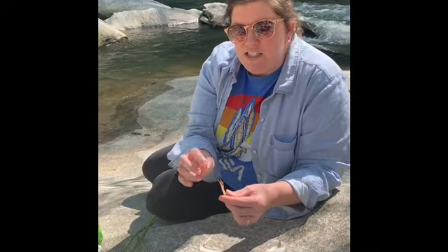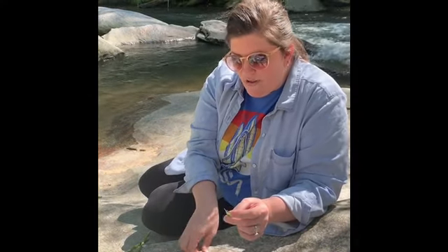Alright, and so then I have these little pieces at the top that almost look like seeds. This is part of the male part of the flower. Alright, the male part is called the stamen. It has the word men in it, stamen, and it has this anther part that looks like a seed at the top that is attached to this long piece called the filament. Alright, so together the anther and the filament make up the stamen.